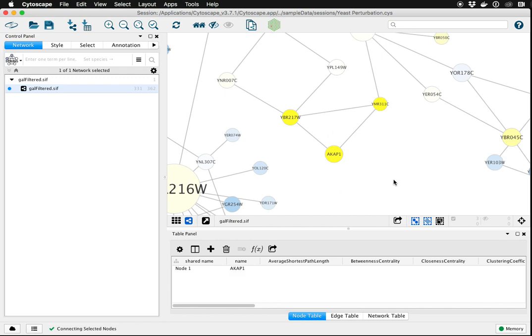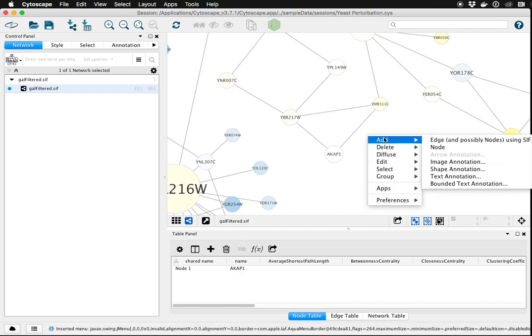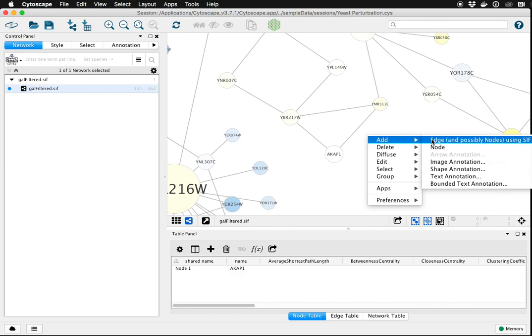It can save you time if you want to add multiple edges. The final way to add new nodes and edges is to again right-click on the background and choose Add Edge and possibly Nodes using the Simple Interaction Format, or SIF.